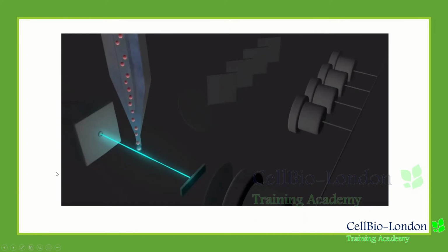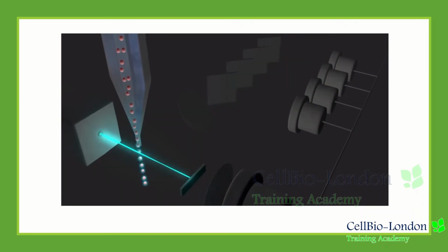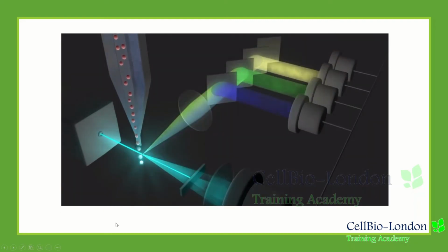Normally, fluorescence measurements are taken at different wavelengths and can provide quantitative and qualitative data about fluorophore-labeled cell surface receptors or intracellular molecules such as DNA and cytokines. Most flow cytometers use separate channels and detectors to detect emitted light, the number of which varies according to the instrument and the manufacturer. That's why, again, when you're doing repeats, you have to make sure that the 3 repeats are done on the same instrument.